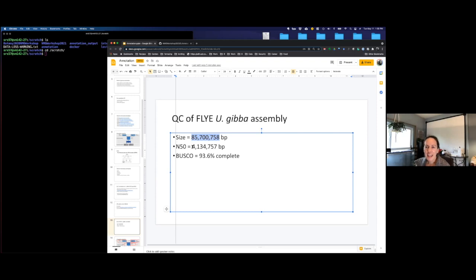How long do you think an average gene is in an organism is something to consider. So if your N50 is only like 5,000 base pairs, that means there's a lot of stuff in there that's smaller. So your ability to actually find genes on those contigs isn't going to be very good because you're going to be missing starts and stops, most likely. Genes are going to be found between different contigs and that sort of thing. So the higher the N50 in many ways, the better. But definitely, if you had something really low, it's probably best just to work on your assembly instead of wasting time annotating, because it is a bit of work.